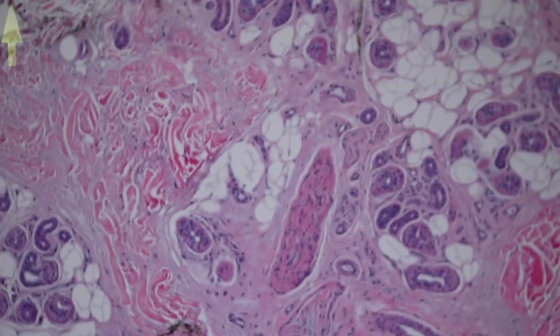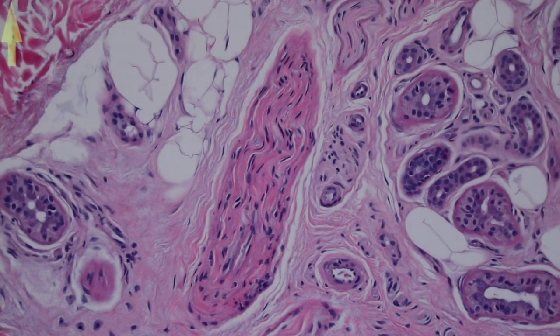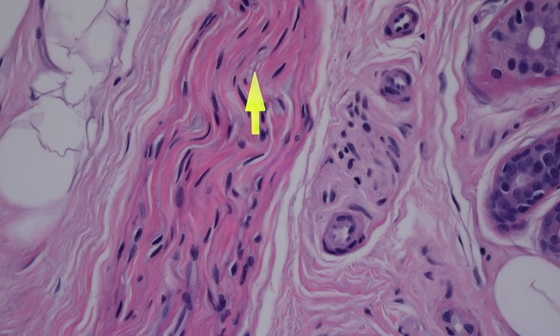Here we have another structure — a pink bundle. Remember, pink bundles can be nerve, smooth muscle, or dense regular connective tissue like you'd see in tendon or fascia. In this case it's nerve. Nerve is kind of wavy — it undulates back and forth. And when you look closer, you can see this little line in the middle — that's actually an axon.